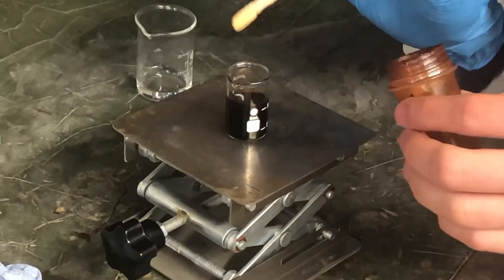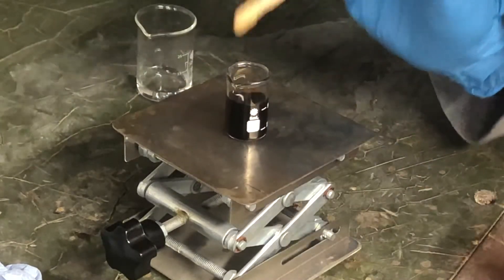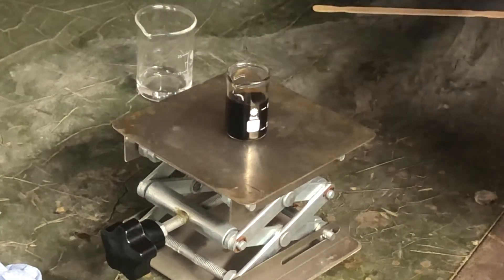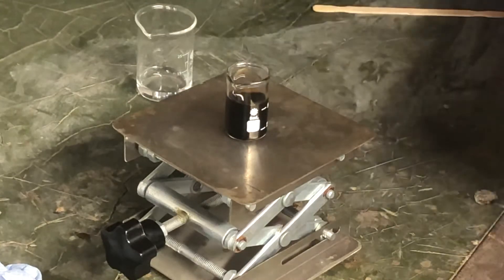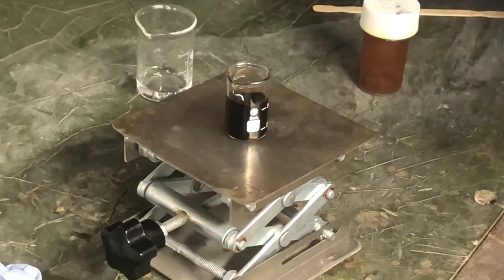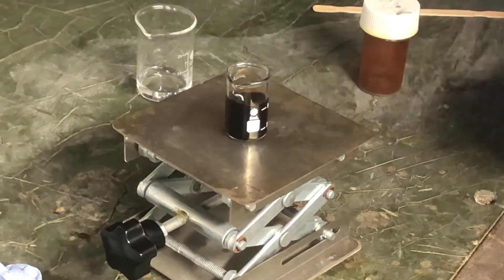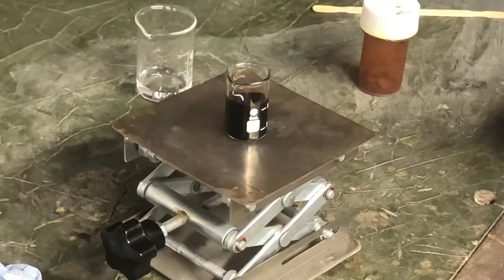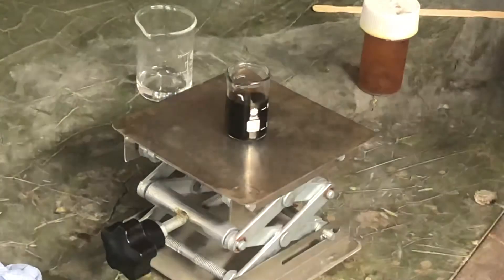So this is forming our iodoacetone, but as a side product, it forms hydroiodic acid, HI, the iodine equivalent of hydrochloric acid, which is actually a controlled substance in the United States, which is surprising.